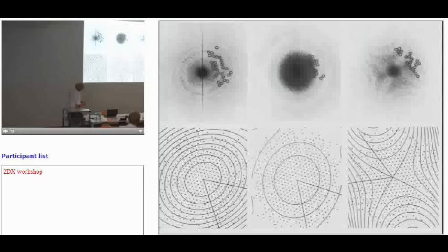So this is the original diffraction pattern. This is the processed image with the spots that have been detected by the MMBox algorithm. This was an image from when we were doing this. Bob Glaeser was visiting for a year on sabbatical, and he persuaded Ken Downing to take a few micrographs on their microscope at minus 100 degrees centigrade. It wasn't very cold. They had bad vacuum problems, but it was partly cold, and it was a field emission gun microscope. And Ken sent this one image, which also turned out to be very good.